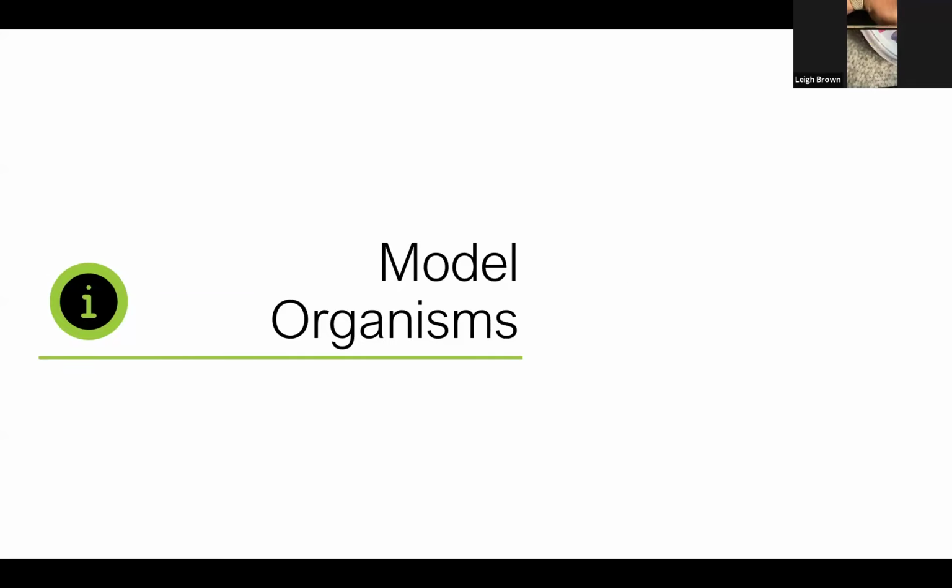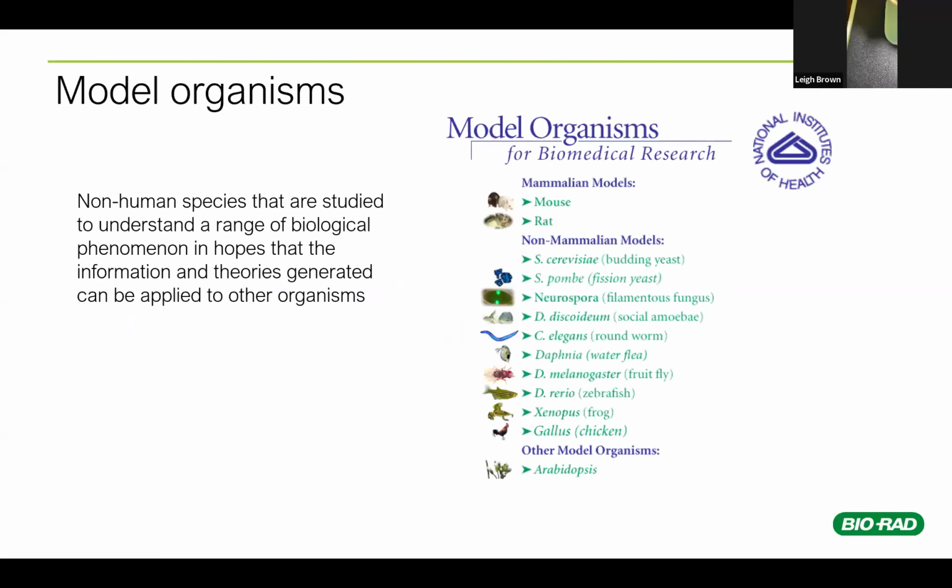Okay, so you can just kind of keep that in mind for later. Yep. And we'll probably be able to see that within 10, 20 minutes. You'll have a really obvious sign of what decisions your wild type and your mutant are making. So in that interim, now we're going to back up and do the theory that you would usually do in your class before starting all of this lab stuff. But we just wanted to make sure that we had enough time that the worms would assay for you while we were all here.